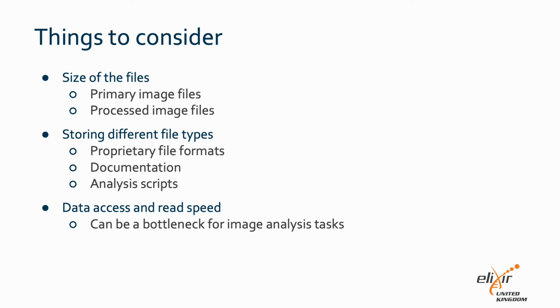For bioimage data, you will need to store multiple different file formats. If you are using multiple instruments, these may output different proprietary file formats, and you will also need to store metadata and documentation files. If you are analyzing your data, you may need to store the analysis code.